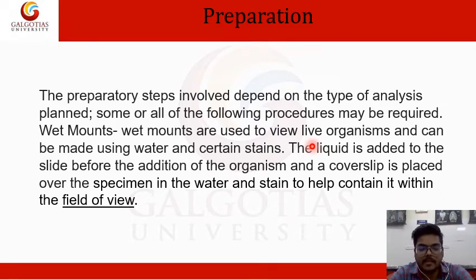A cover slip is a type of small cover which helps the specimen and stain to stay in one place and helps contain it within the field of view.